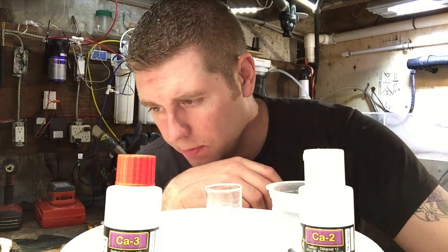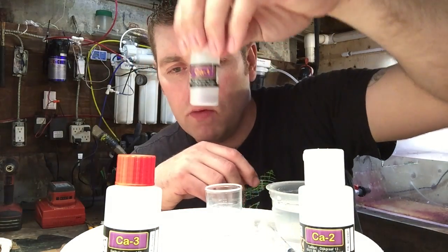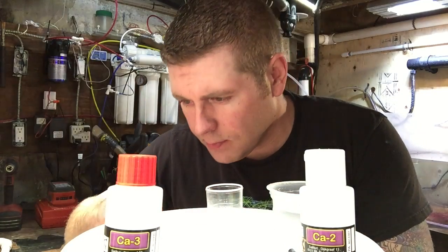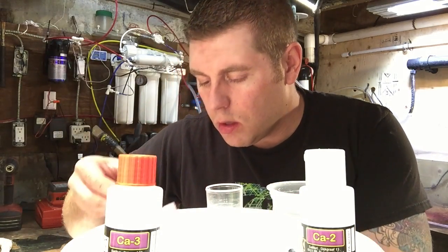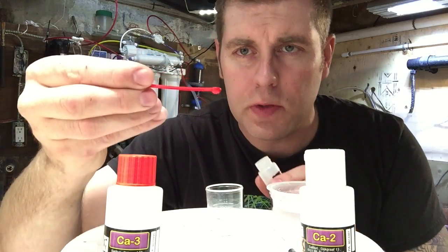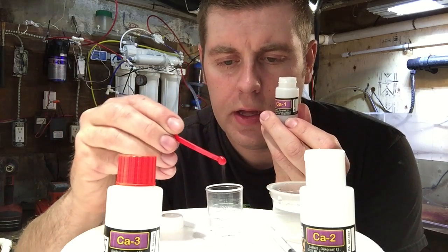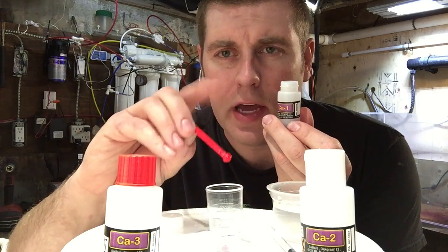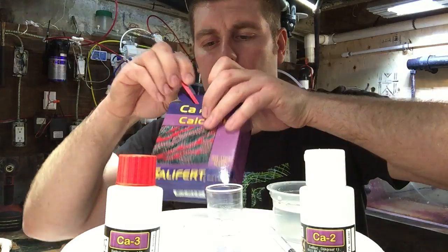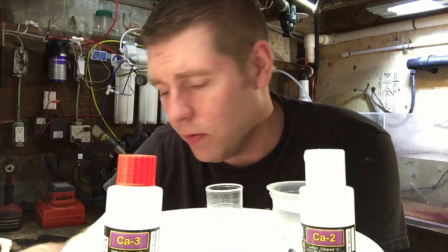The next thing we're gonna do is add a spoonful of the CA-1 powder. Grab your spoon and level it right off. So now you got your spoonful of CA-1 — add that to your test vial that you just filled with tank water. Put the cover back on the CA-1 container so we don't spill it; we want to do more tests without having to buy another one.